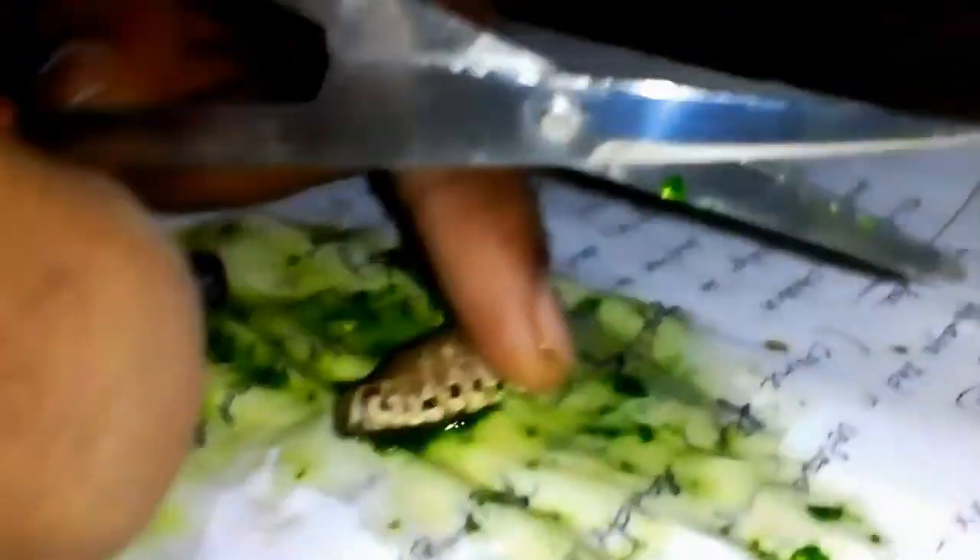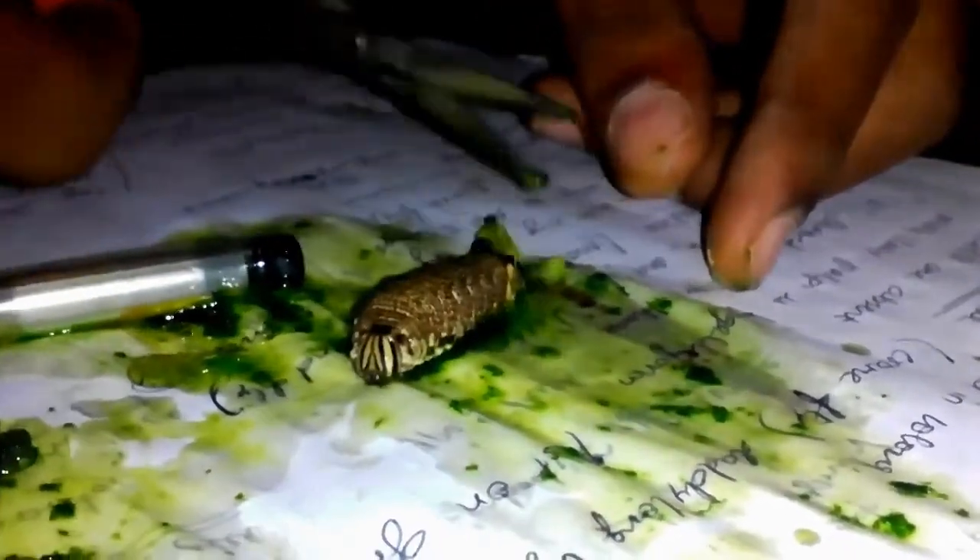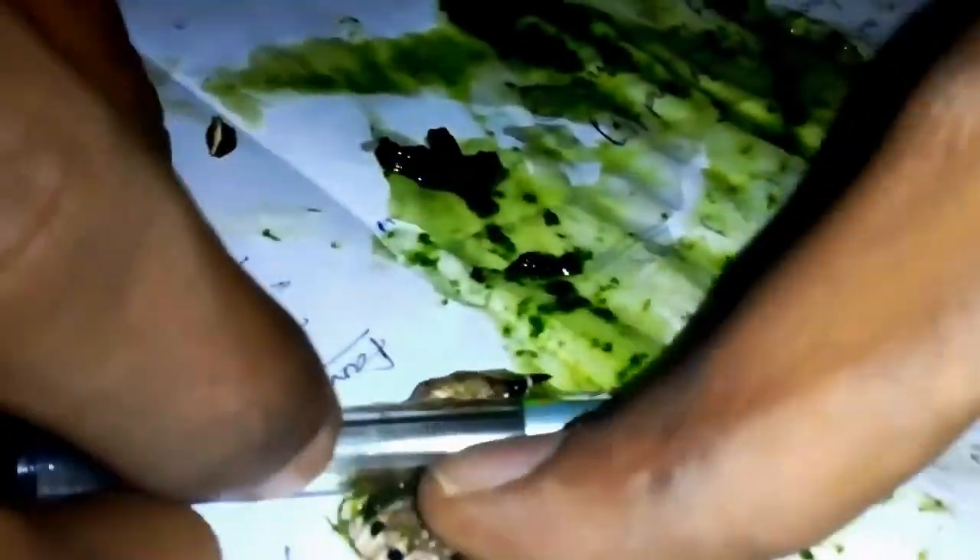Riker mounting is blowing the soft body larvae. It is the most popular method. In this method, first we remove the internal contents of the larvae by cutting the anus, and inflating it like a balloon to its natural size. Dry it in the blowing apparatus.